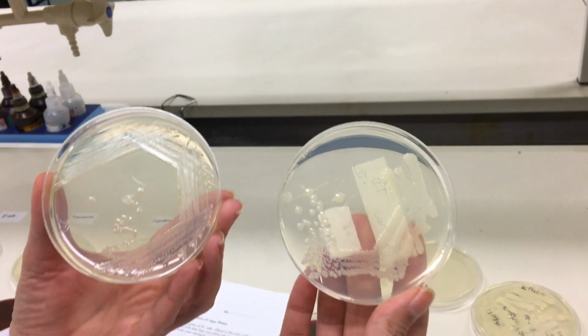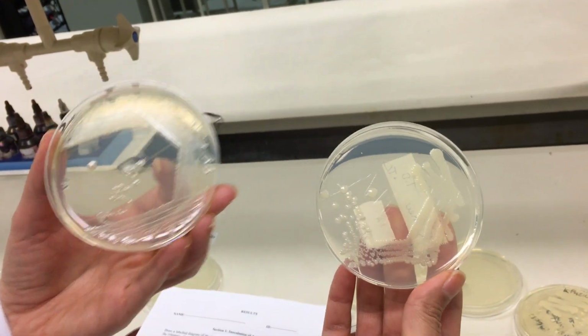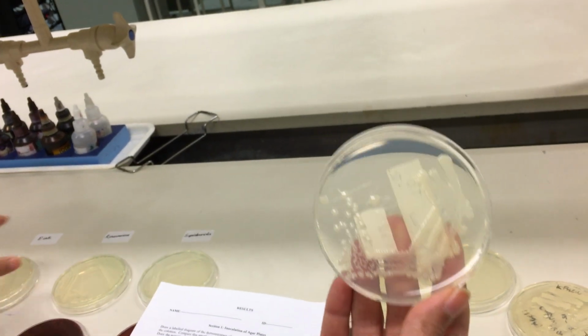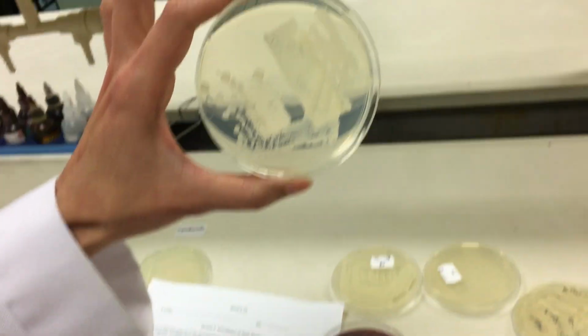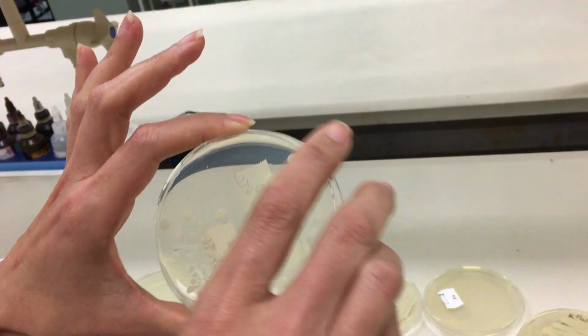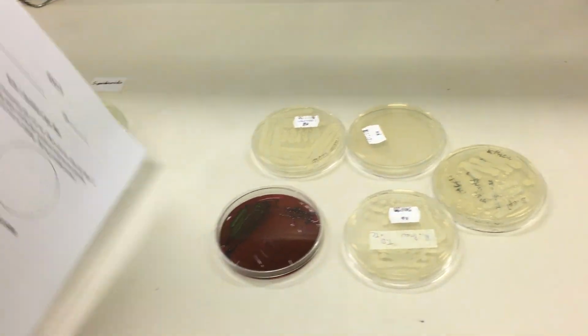So for the demonstrated one, you can come with the left side, this one, and with the streak E. coli plate, your one, you can come up with this. So ideally, you want to present the expected results here with the good streaking technique.